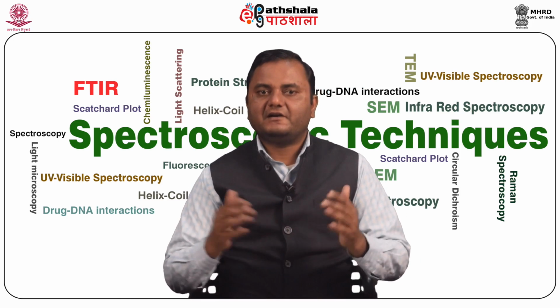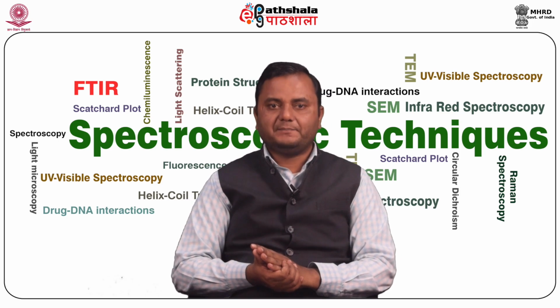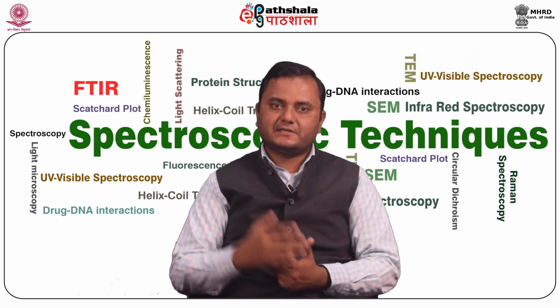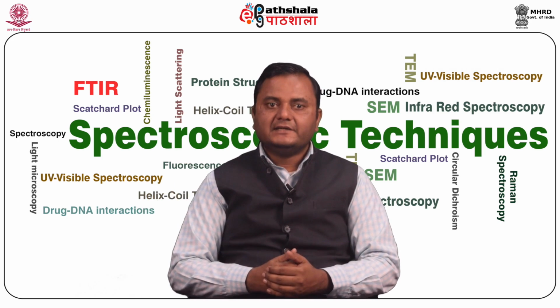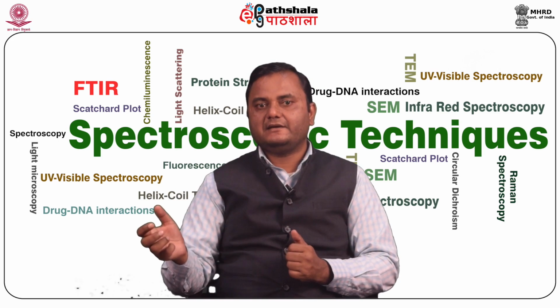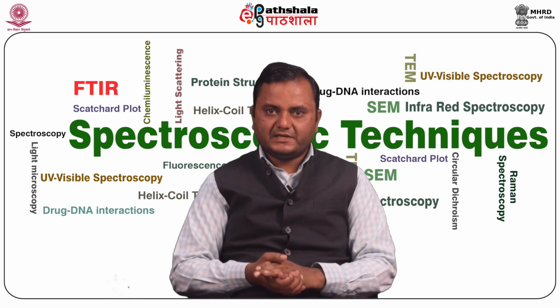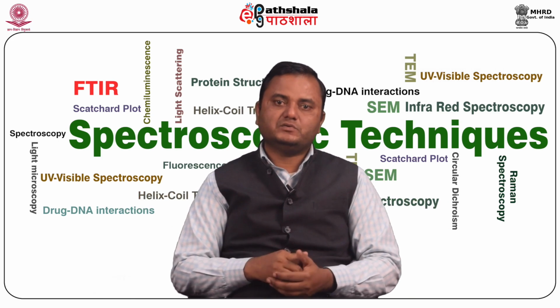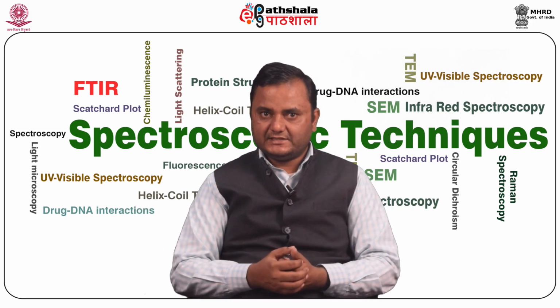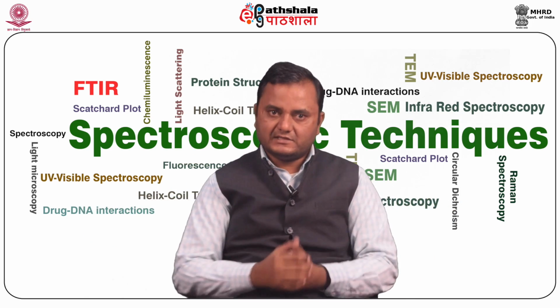Let's talk about the advantages of FTIR. The first advantage is the multiplex advantage, that is, having a high signal to noise ratio as compared to the dispersive instrument. The FTIR collects all resolution elements with a complete scan of the interferometer, and the successive scans of the FTIR instrument are co-added and averaged to enhance the signal to noise ratio of the spectrum. As the number of scans increases, the signal to noise ratio increases, and data quality is enhanced very well.